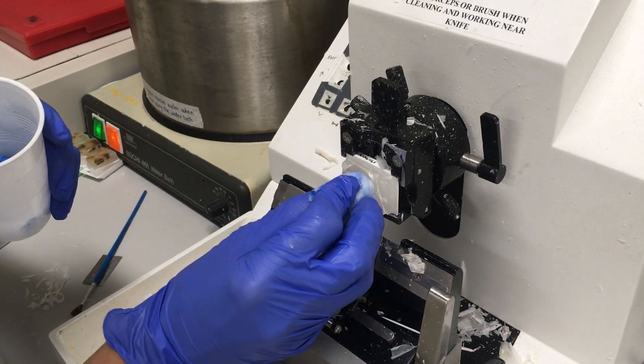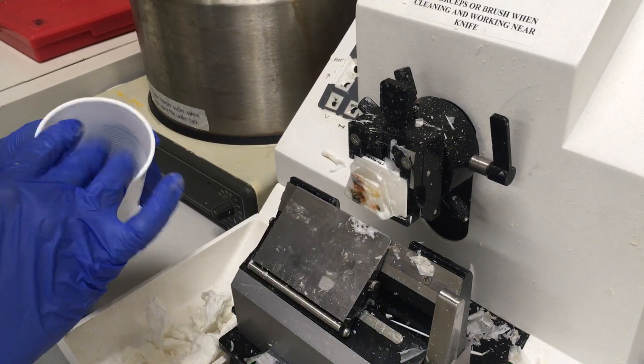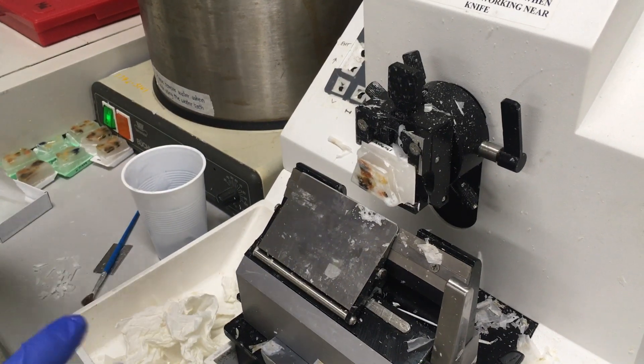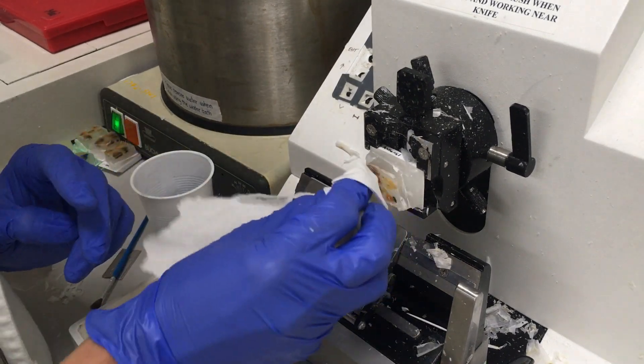I'm applying some hand soap to soften the tissue a little bit because it helps make very lipid-heavy tissues more pliable. I have a lot of ripe eggs on these samples.